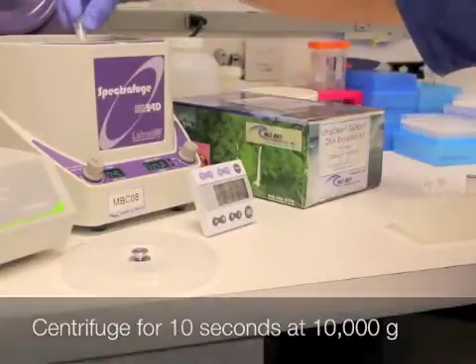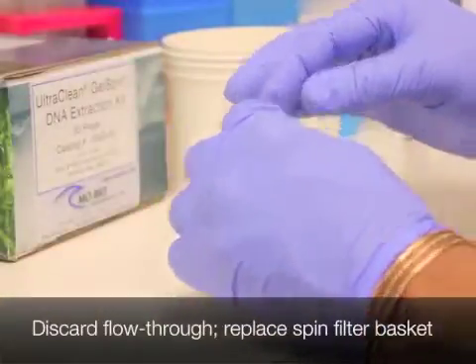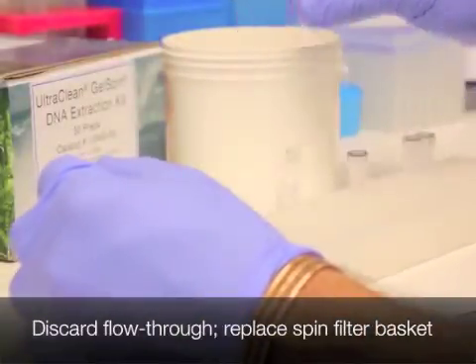Centrifuge for 10 seconds. Discard the flow-through and replace the spin filter basket.